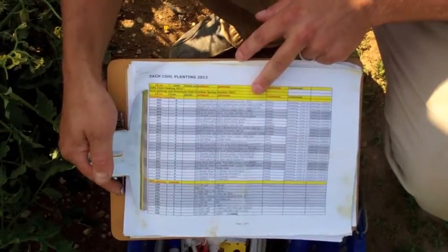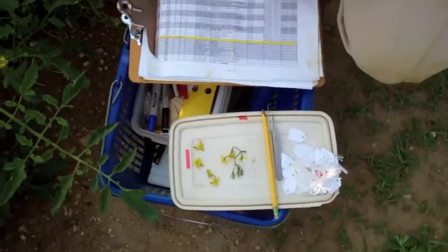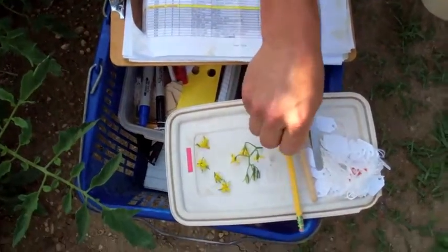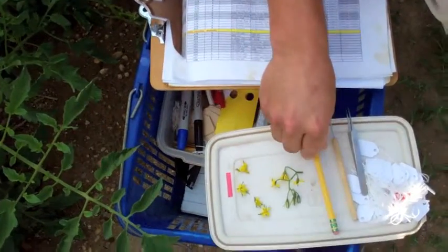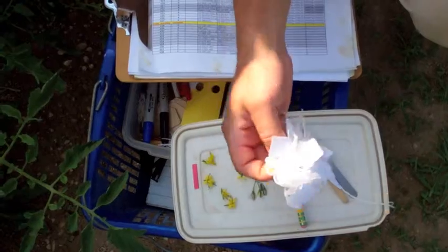The most important tools you need for a cross are tweezers for emasculation, a pollinator to extract pollen, a pencil to prepare your crossing tag, and crossing tags.